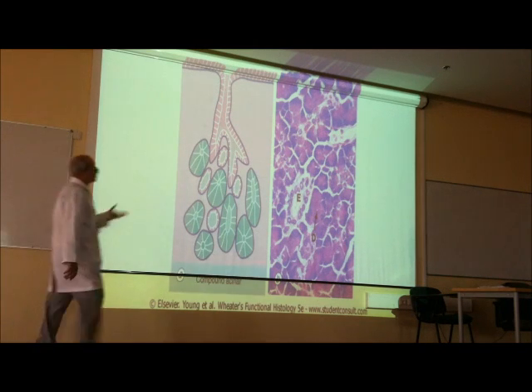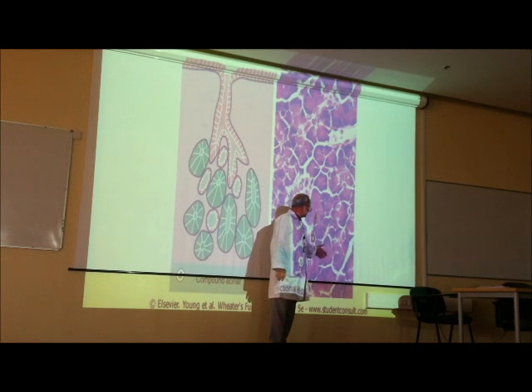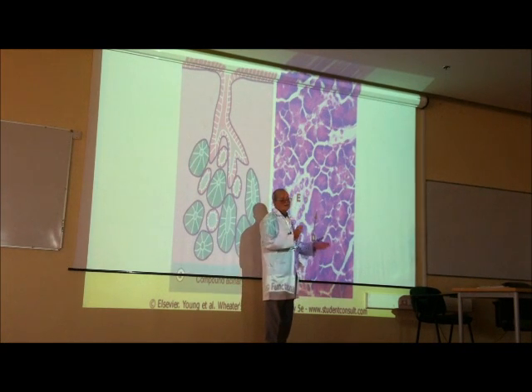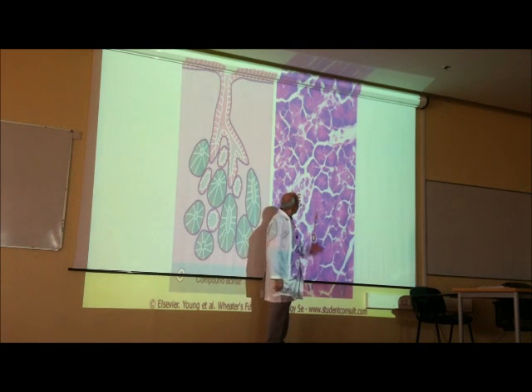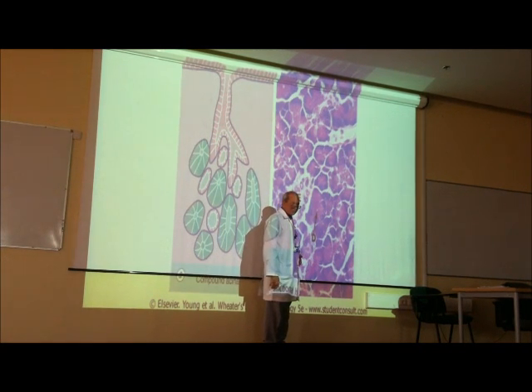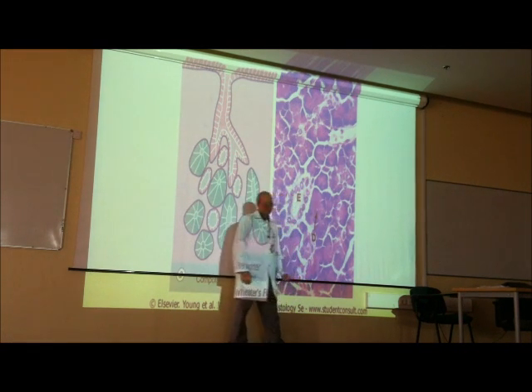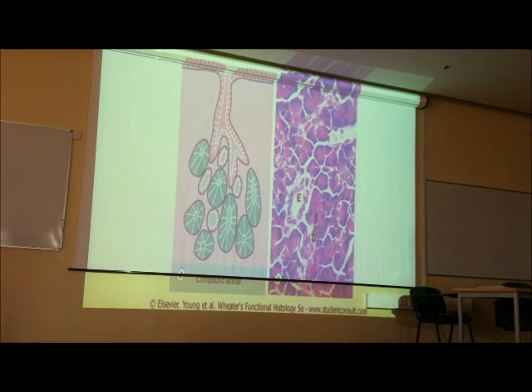Okay, what's about this structure? Serous acini. Why? Nuclei rounded. Non-lumen. Not well-defined cell boundaries. Okay? Serous acini. What's its function? For the type of secretion. Water secretion containing enzymes.